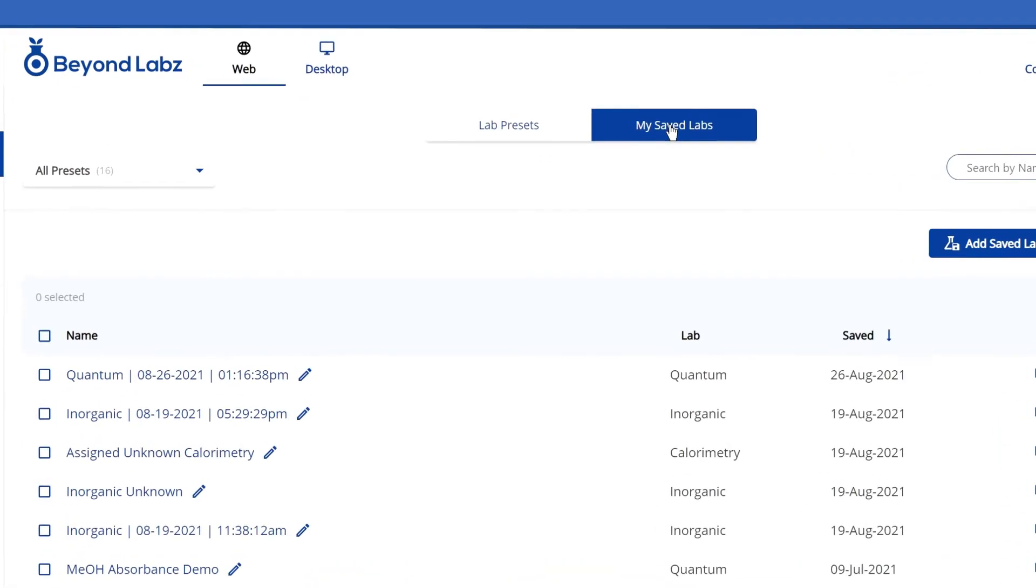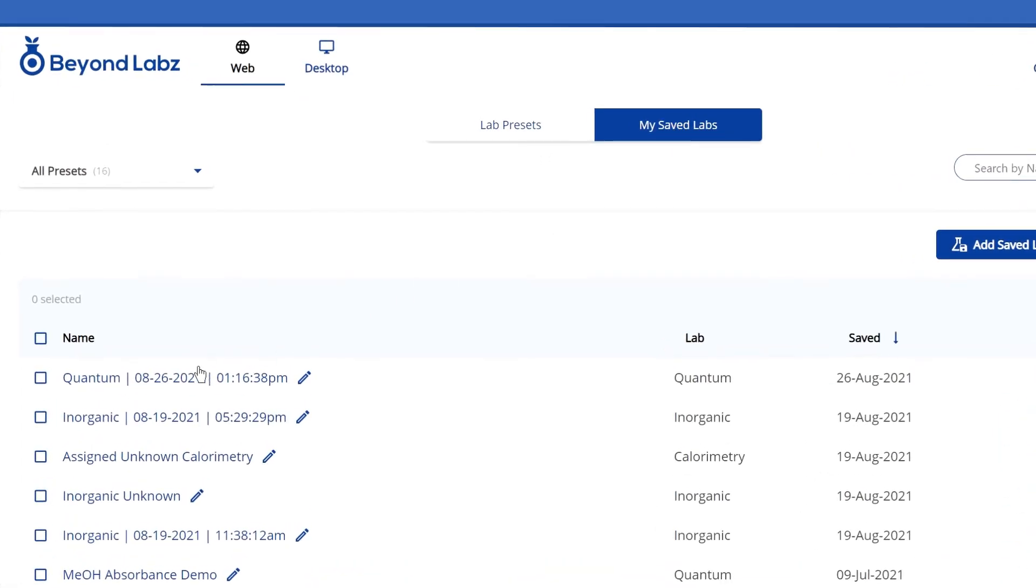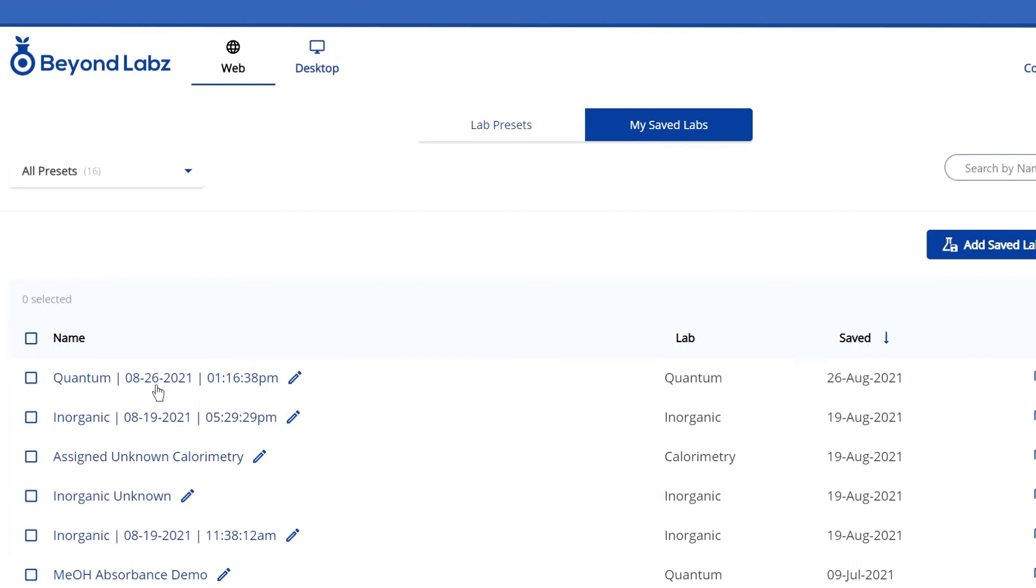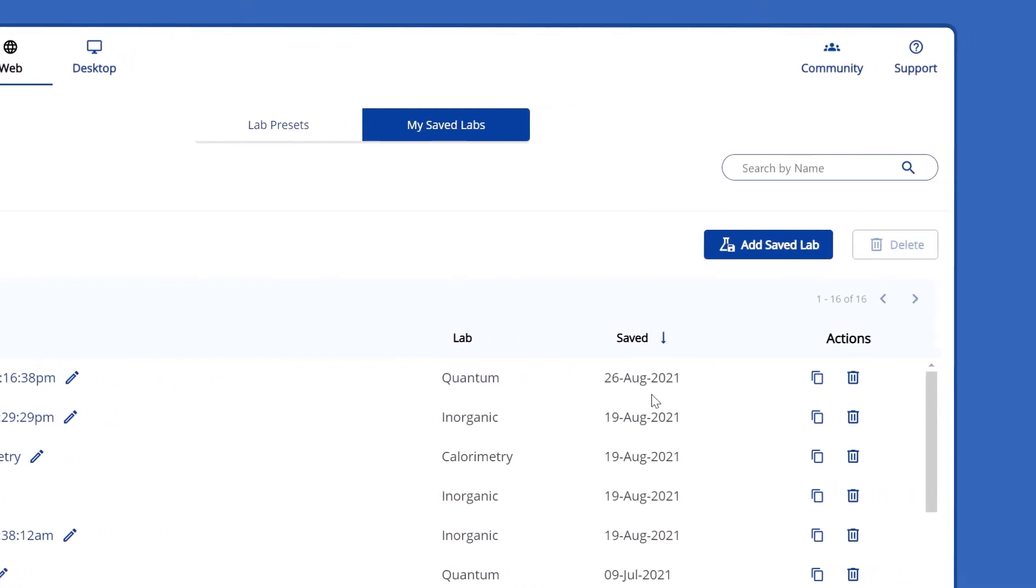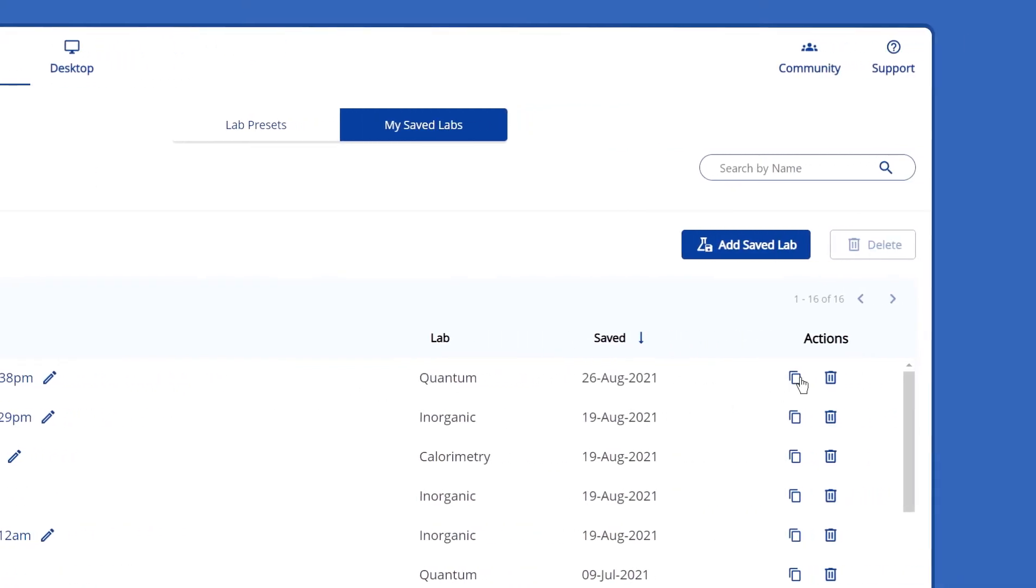Under My Saved Labs, view the labs you created and copy a shareable link that can be sent to students and instructors.